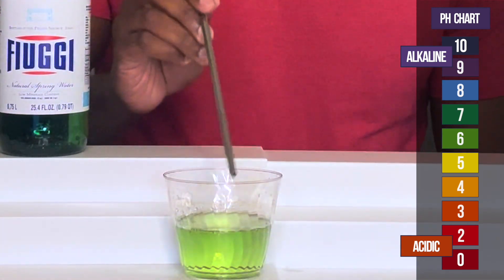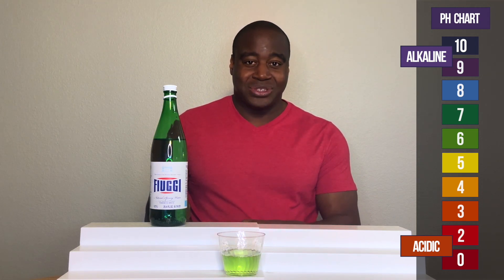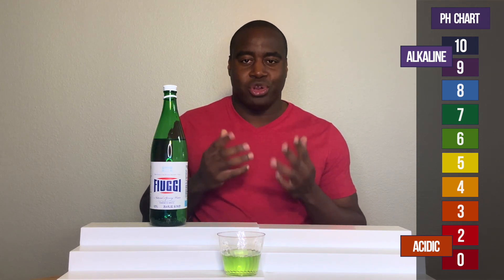Alright, so it looks like it dropped down to something either above or below neutral, or around neutral.